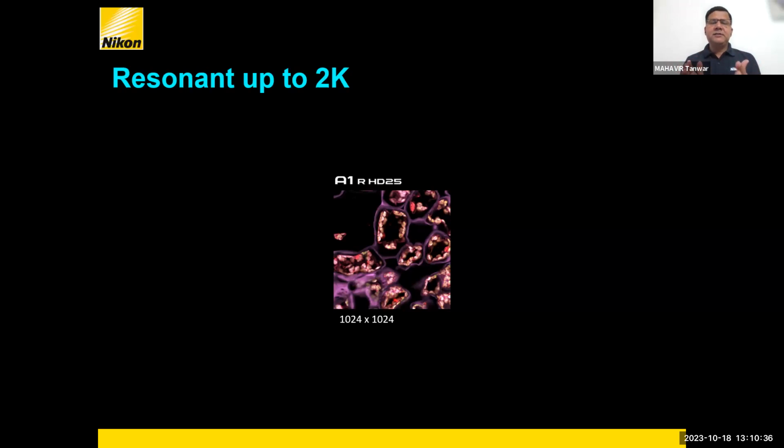In the case of the resonance scanner, one mirror of the galvo is fixed. They use one mirror of the galvo and one separate mirror, a high-speed resonance scanner, which moves at a speed of 8 kilohertz. That means a very high frequency, and it writes at a very high speed. Both are built into one box, one scanner. We call it a hybrid.